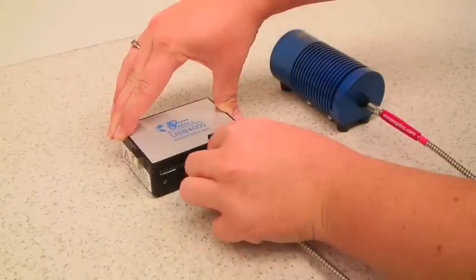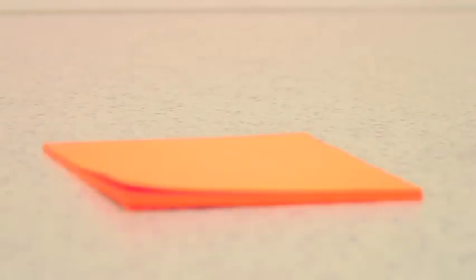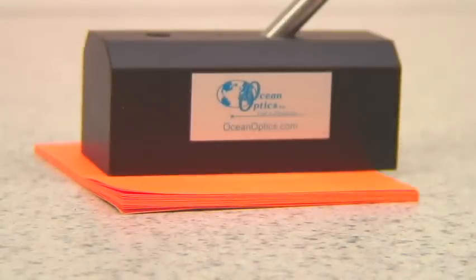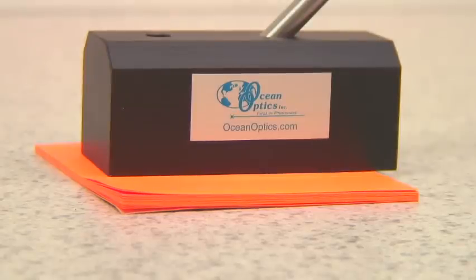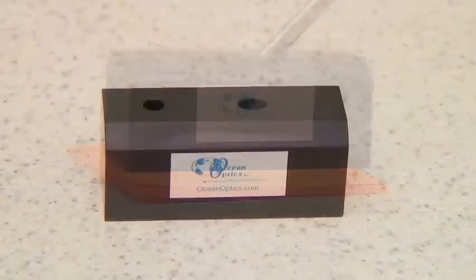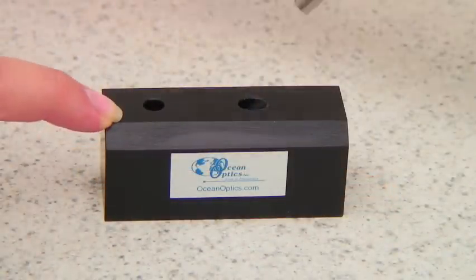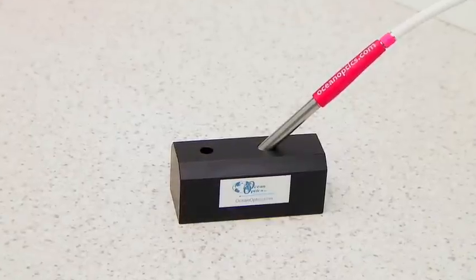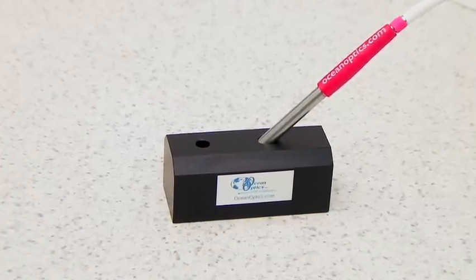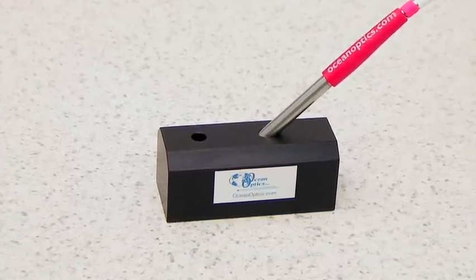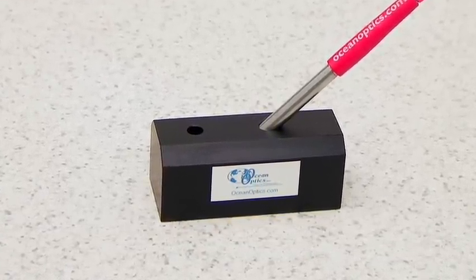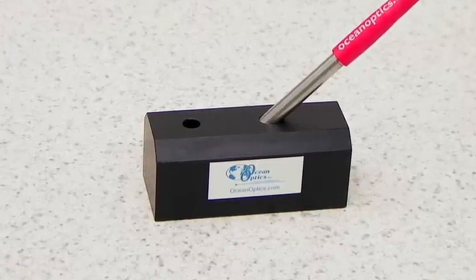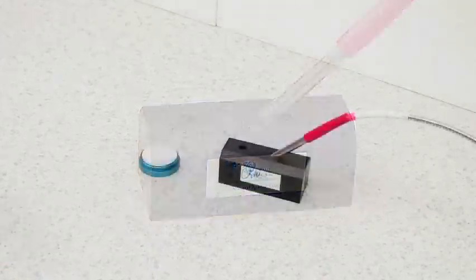For reflection measurements, it is also critical that all reference and sample measurements be taken at the same distance from the tip of the reflection probe to the sample. The RPH1 reflection probe holder ensures that this distance is fixed and the same for all measurements. Insert the reflection probe into the hole cut at a 45 degree angle and tighten the screw to secure the ferrule into the RPH1.